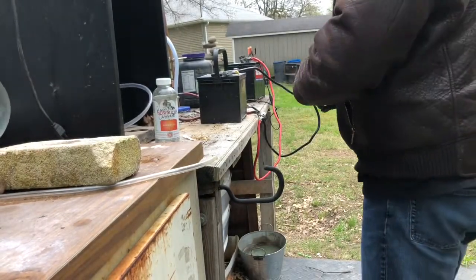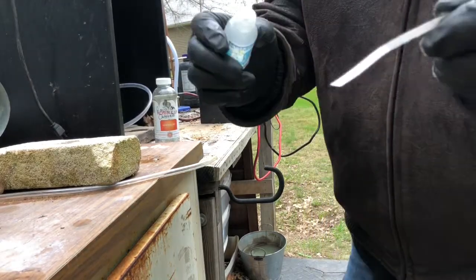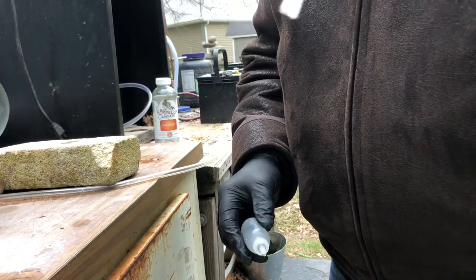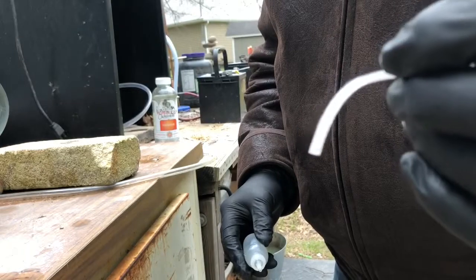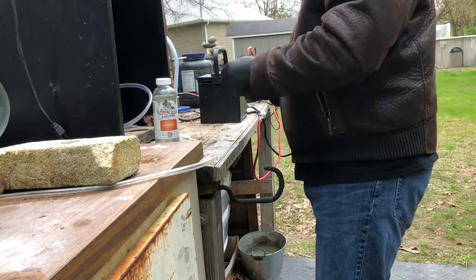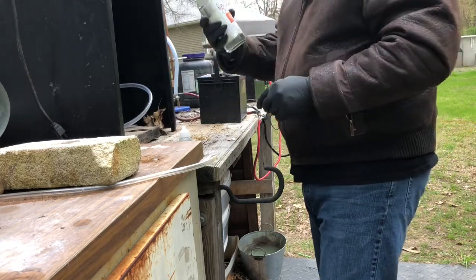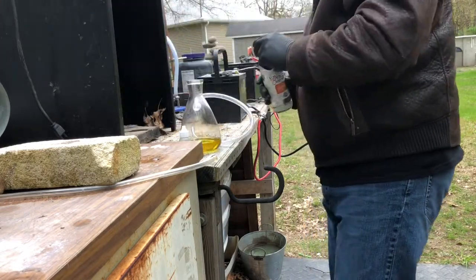Alright, so here we go with the stannous chloride test. It should turn brown or even orange — and it did nothing of the kind. So that seems to indicate there's no platinum. But I have some ammonium chloride, and I'm going to pour it in here anyway and see what happens.